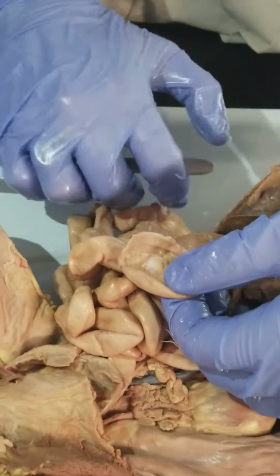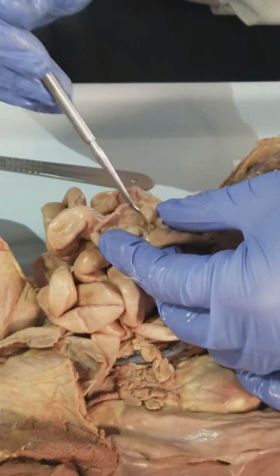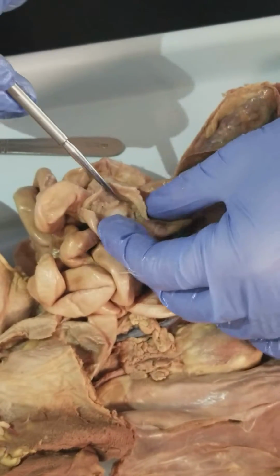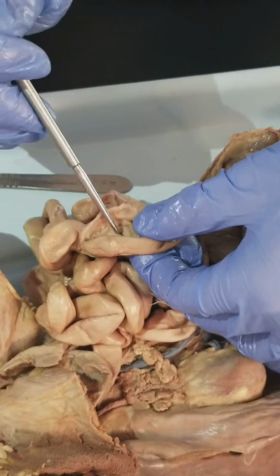So there you can see the ileocecal valve, right there. Okay.